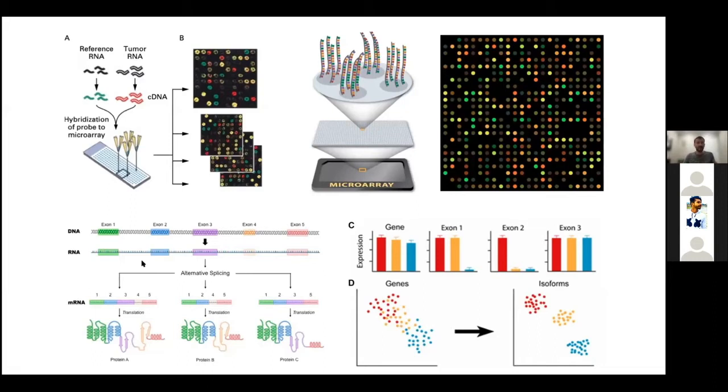So really it becomes a statistical problem to identify first where those reads are mapped to, and from mapping to identify how they are distributed per sample, because we are talking about bulk RNA, so we're actually sampling multiple cells, and then to infer from there, which is what you see right here, how that helps us discriminate between different cell types. So here you can see that genes might have a lot of overlap because we are using some kind of approximation. But when we are talking about this more detailed view of isoform and alternative splicing or exon-specific expression, we actually do have a lot of times a clear separation between conditions.